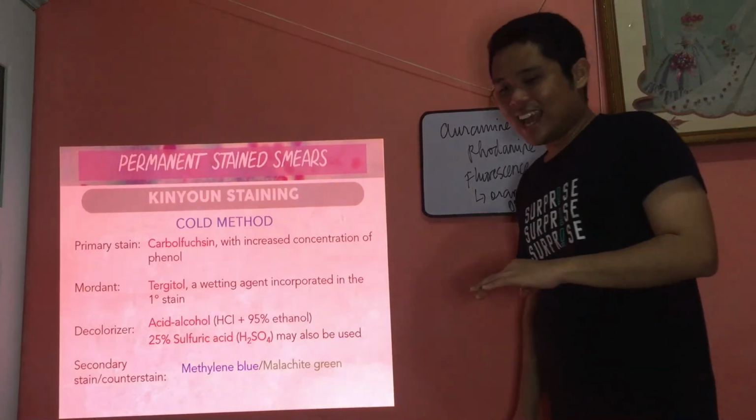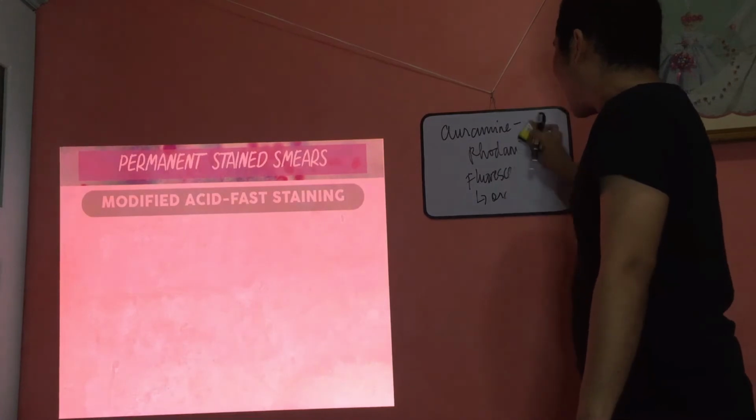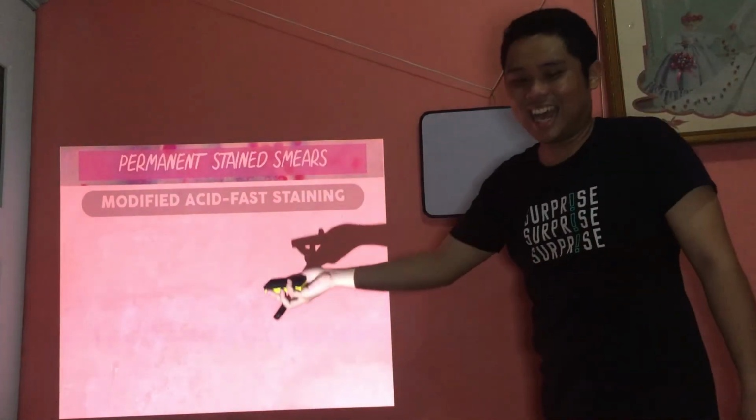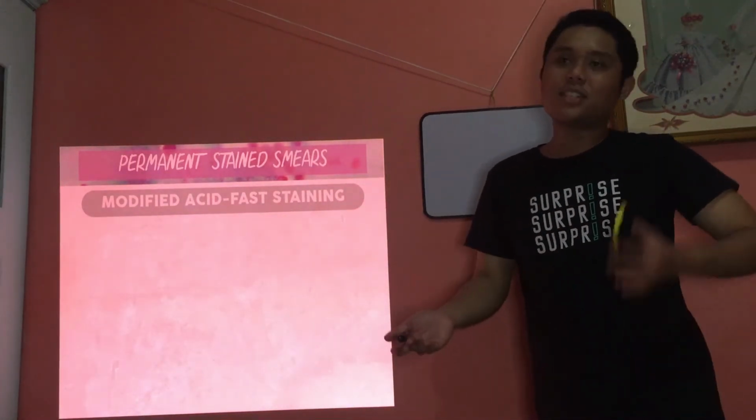Alright, okay. And lastly, we go now to the modified acid fast, which is of course what we are after. Dami nating chika, ito lang pala yung kailangan natin. So at least now you understand. Why is it called modified acid fast or acid fast?